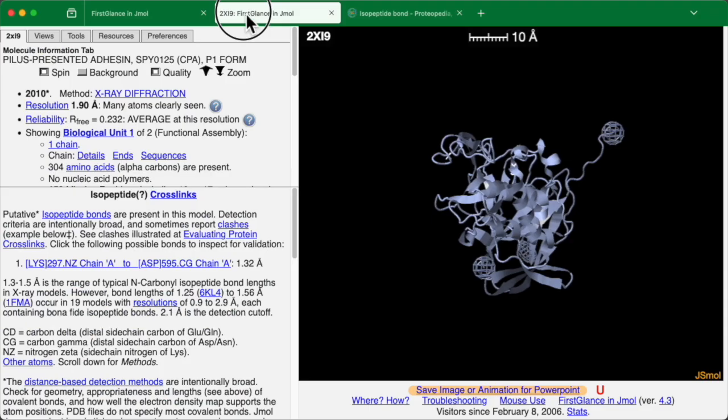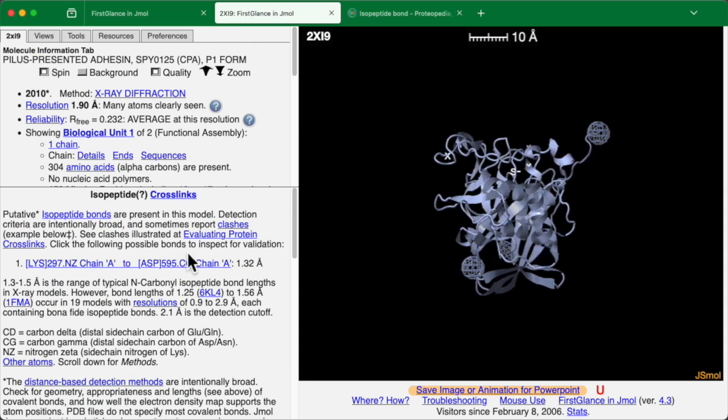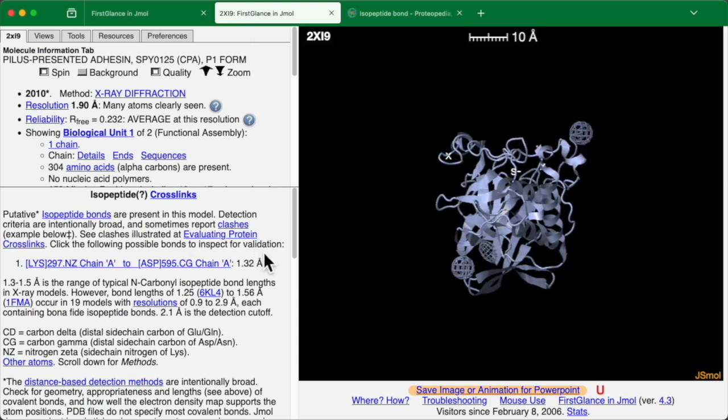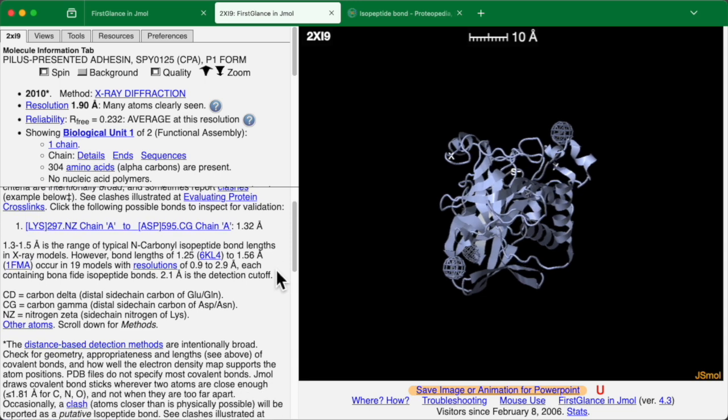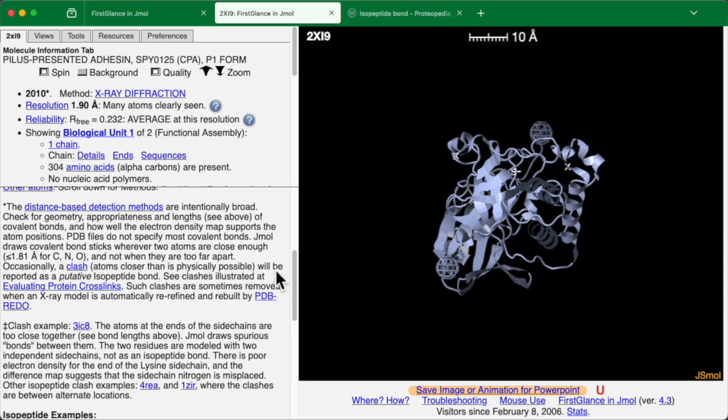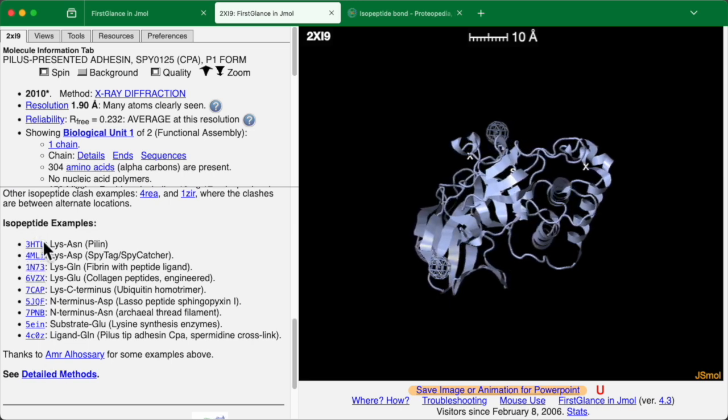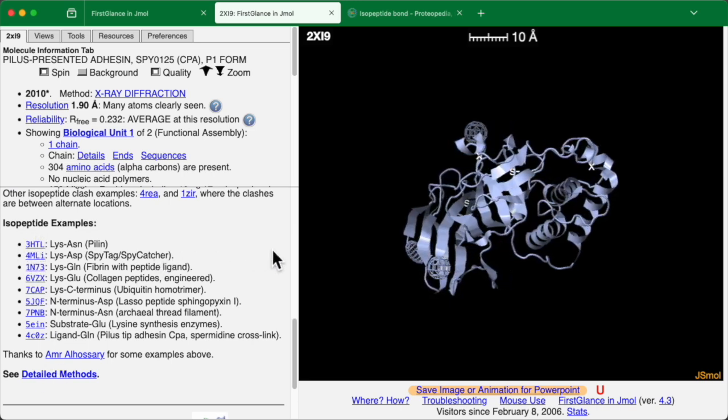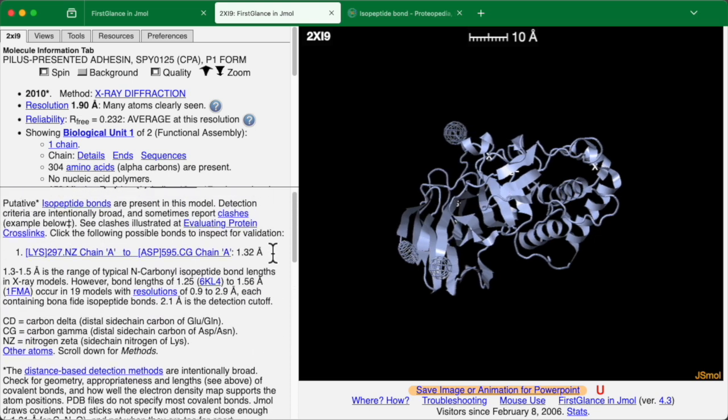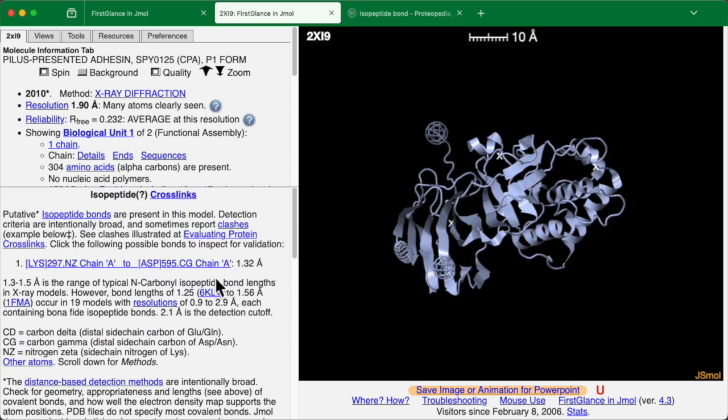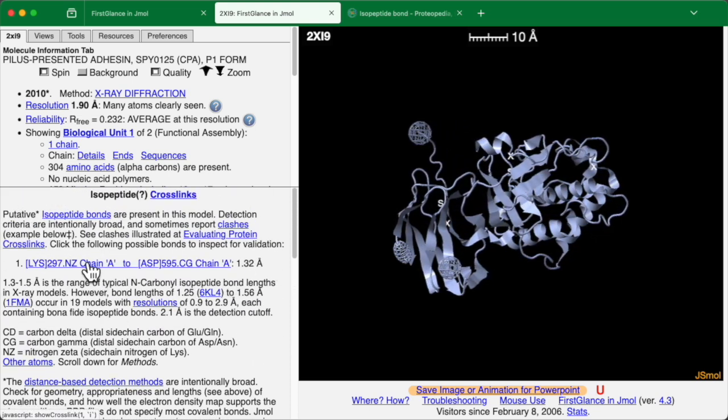Now we'll return to FirstGlance. And I want to point out that also typical of FirstGlance, if you scroll down in this help panel, there are many examples of molecules that have isopeptide bonds. So to explore the one that FirstGlance has suggested here, we'll click on this link.